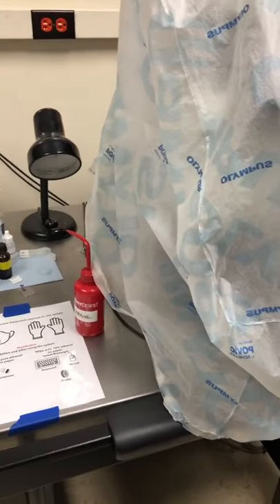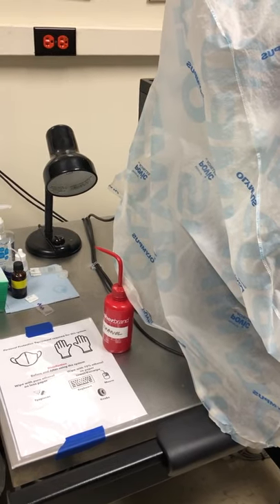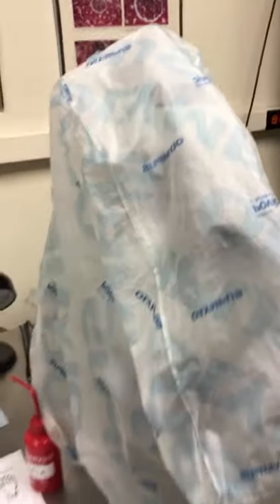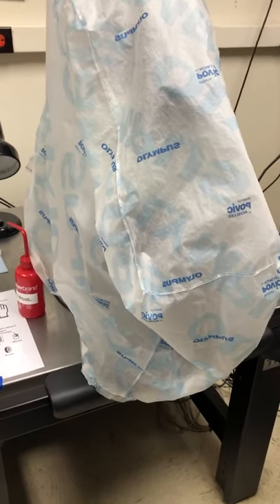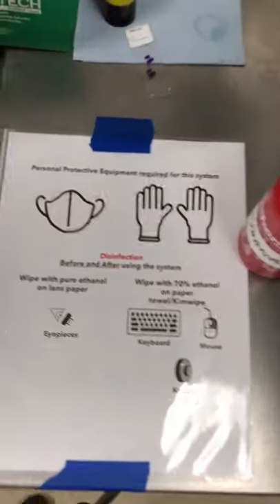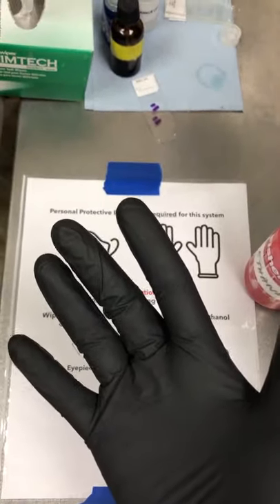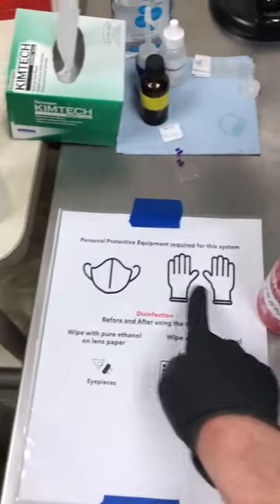Hello. The purpose of this video is to remind you how to use the BX61, which is currently under this dust cover, to take bright field images. New rules: we have to use PPE for the system. That includes masks and gloves. Here are my gloves and here's my mask. That's done.